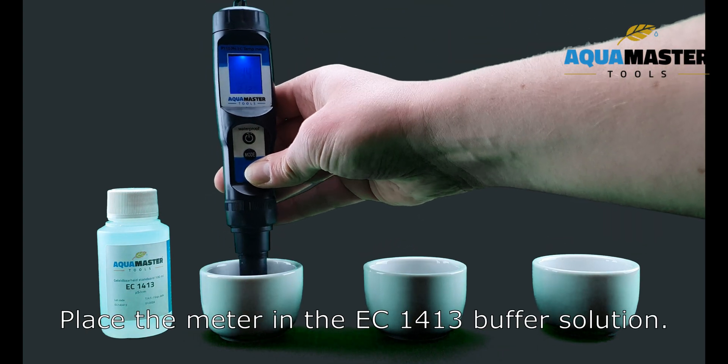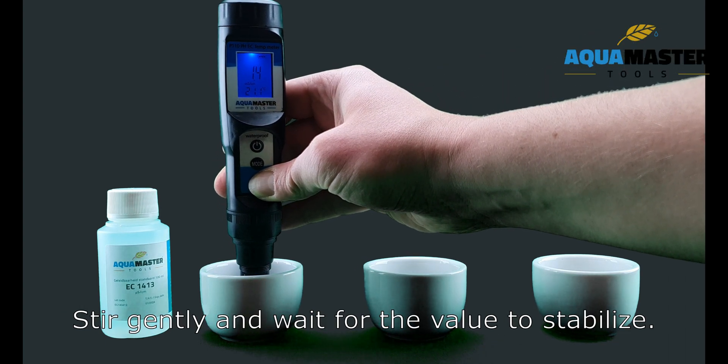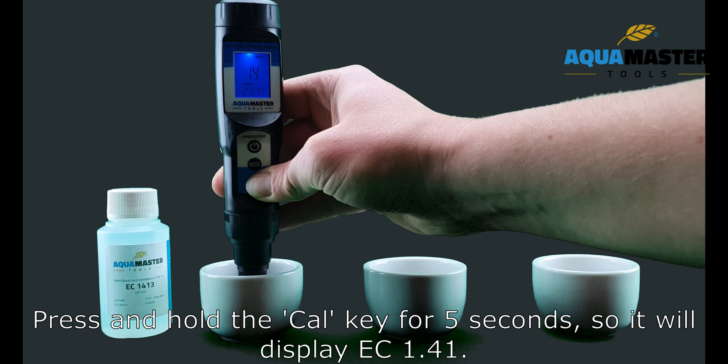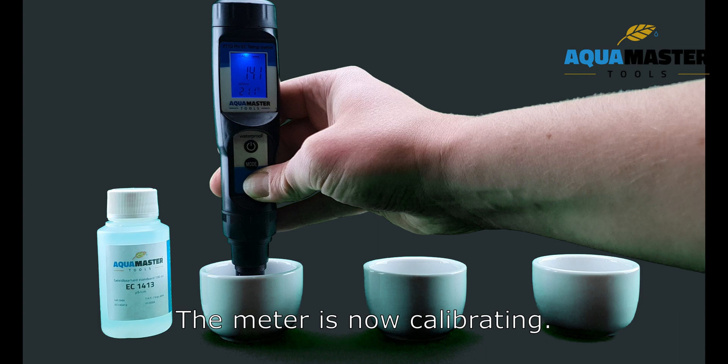Place the meter in the EC1413 buffer solution. Stir gently and wait for the value to stabilise. Press and hold the CAL key for 5 seconds until the display shows EC1.41. The meter is now calibrating.